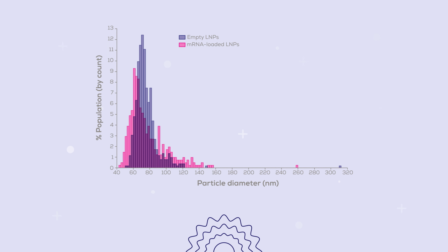Let's compare that DLS data with TRPS measurements generated in-house using the same mRNA-loaded LNPs. You'll immediately notice that TRPS can provide much more nuanced information. First, we identified a non-normal distribution, making mode size the most appropriate to report.